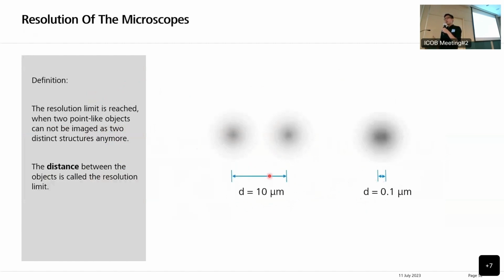But actually, during the practical experiment, we suffer from diffraction. So the light of 1 point is not 1 point. It is actually like an object with some dim rims. So you can see the resolution just deteriorates. We may have like 10 micrometer resolution in theory, but actually it may be much worse. We may only have like 20 micrometer resolution.